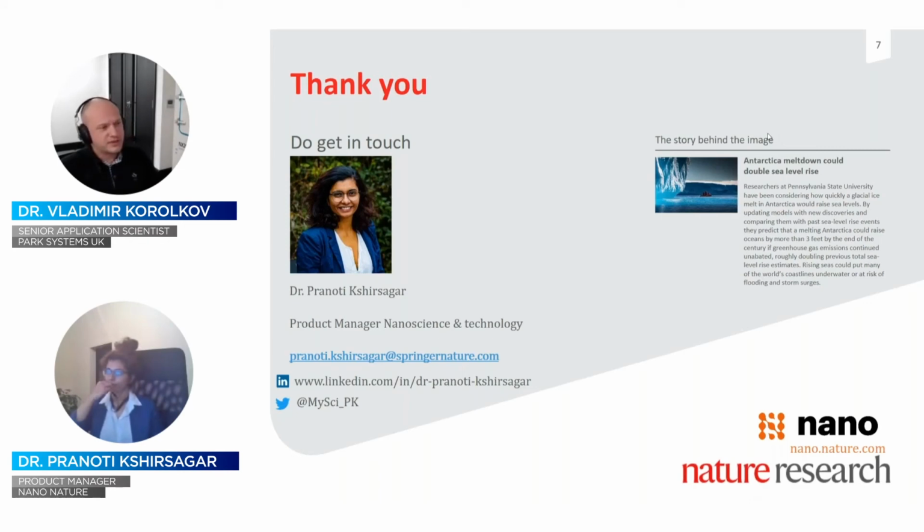From an experimental perspective, because I'm more of an experimentalist than a theoretician, from what I can see, the best resolution that you can get in ambient imaging can be achieved in tapping mode at the moment. It may change, depending on how manufacturers change the way they build microscopes, but at the moment, tapping mode is the highest resolution mode amongst most imaging modes for ambient atomic force microscopy. Great, thank you. Answers the question.